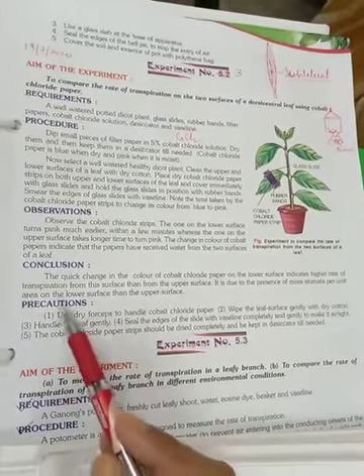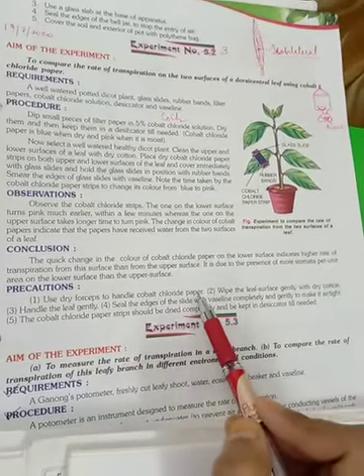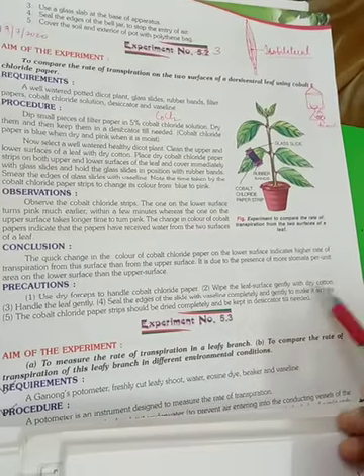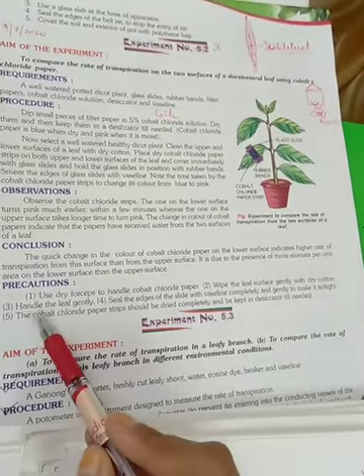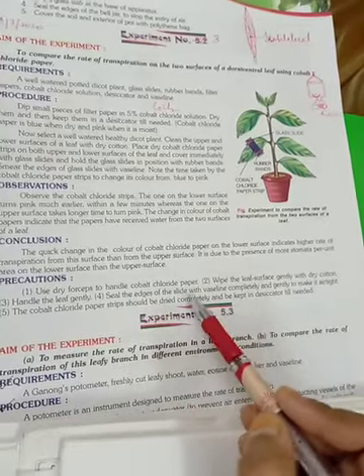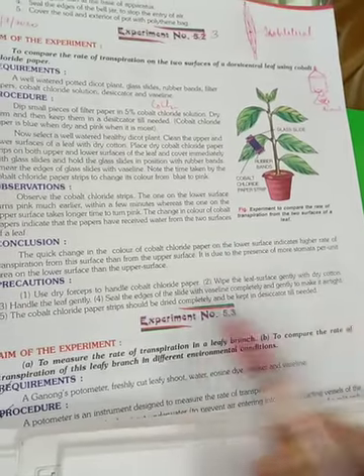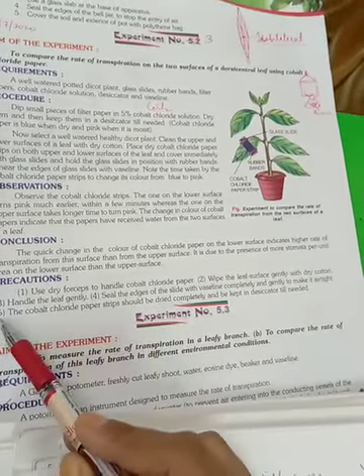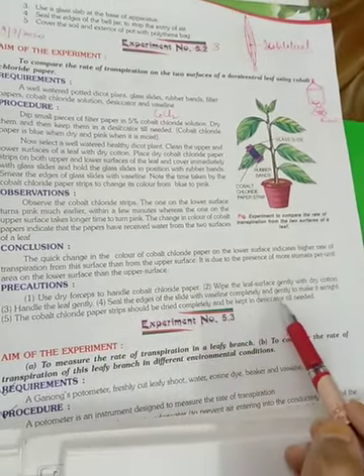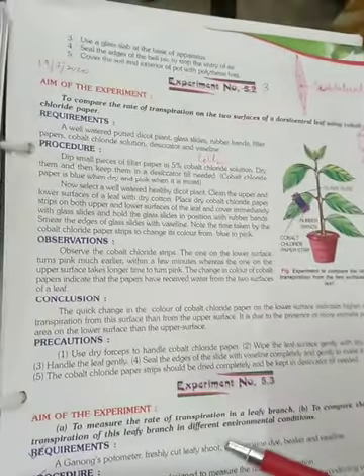And lastly, the heading precautions. First, use dry forceps to handle cobalt chloride paper. Second, wipe the leaf surface gently with dry cotton. Third, handle the leaf gently. Fourth, seal the edges of the slide with Vaseline completely and gently to make it airtight. Fifth, the cobalt chloride paper strips should be dried completely and kept in a desiccator till needed. So that's everything that you need to write, children.